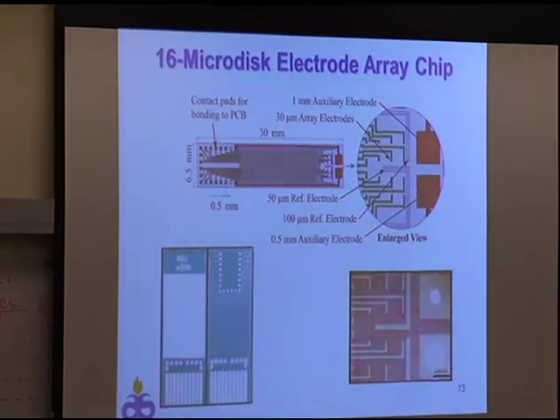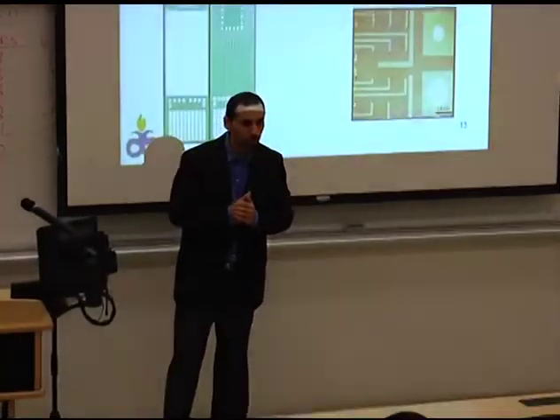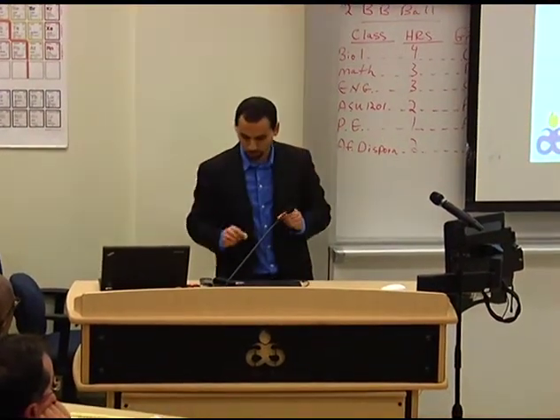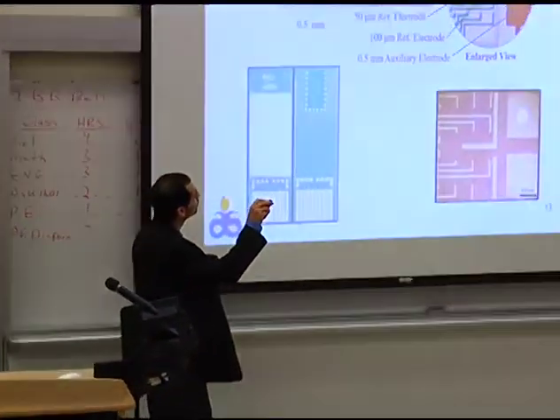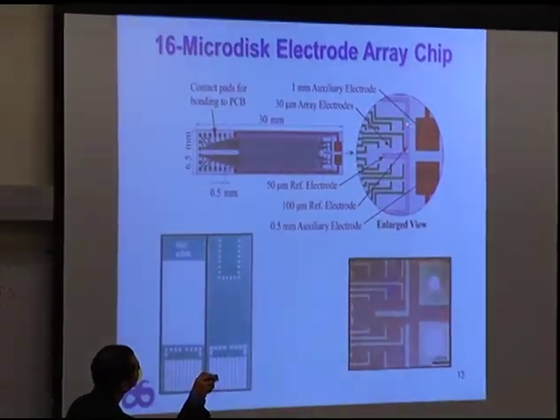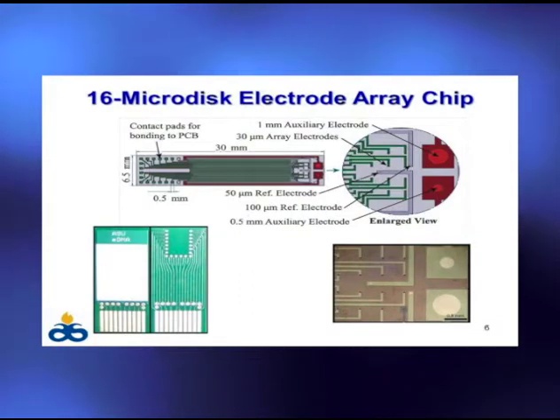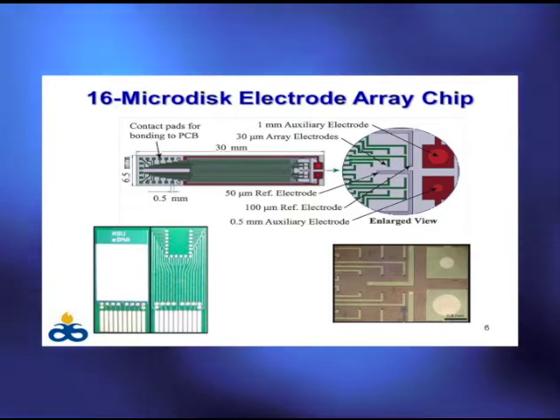Now, that was the potentiostat. That's the instrument. To operate, or make use of that instrument, we need electrodes. What was being passed around was a single microelectrode, right? Real thin. What we have here is 16 of those electrodes, disk electrodes, imprinted onto a chip. So this is what we're fabricating at Georgia Tech's Nanotechnology Center, and that's the second part of the seminar. Dr. Paul Joseph, he'll be speaking about the facilities over there.